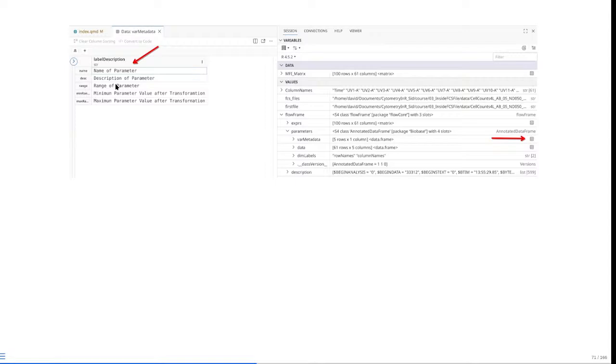So it's relatively simple. It doesn't have anything below it, so it's quite easy to work with. I want to contrast that with what we saw earlier with exprs, where we saw it as being a matrix type object. What we're seeing in this case is showing up as a data frame. And a data frame is a very common object type that we'll see constantly throughout the course. So this is our first encounter with one.